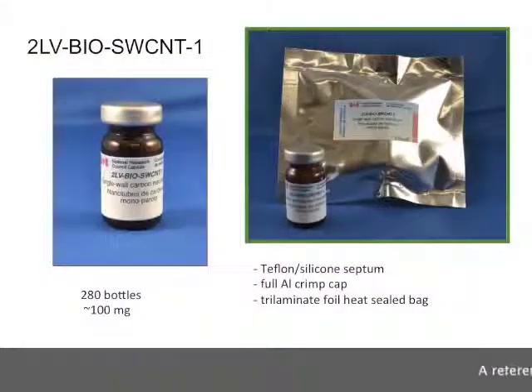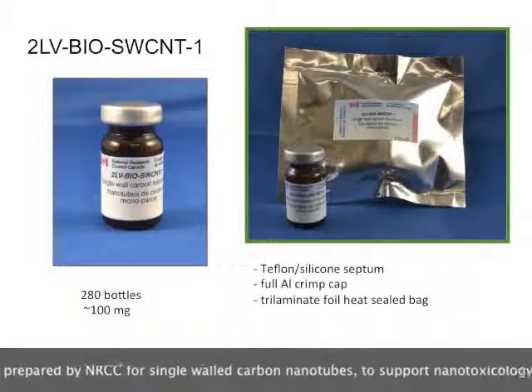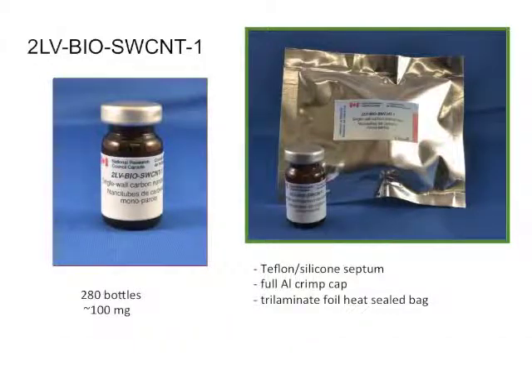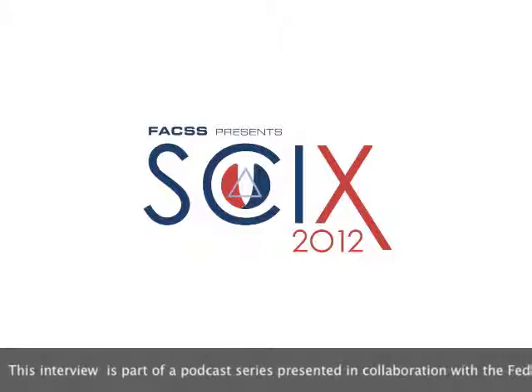have high efficiency. But we have to realize that we're dealing here now with the chemistry of the vapor generation system and not the physics of a mechanical sample introduction system. So as a consequence, vapor generation is always going to be more element specific, but we can have compromised chemical conditions that are sometimes readily available to do 5 or 6 elements at a time. But typically, you're optimizing for 1 or 2, primarily 1 element at a time.